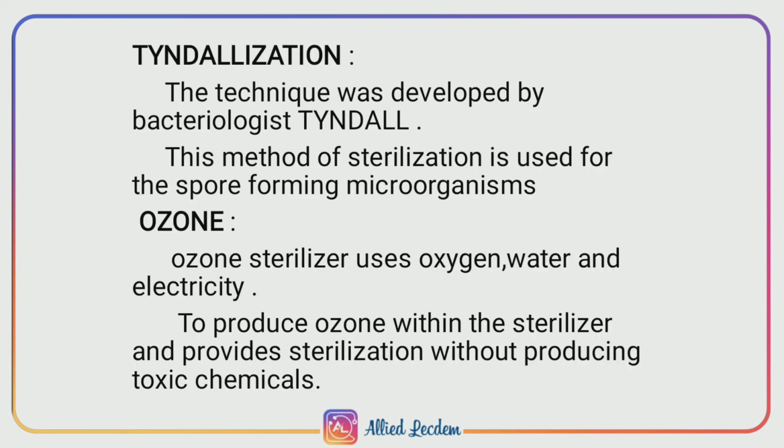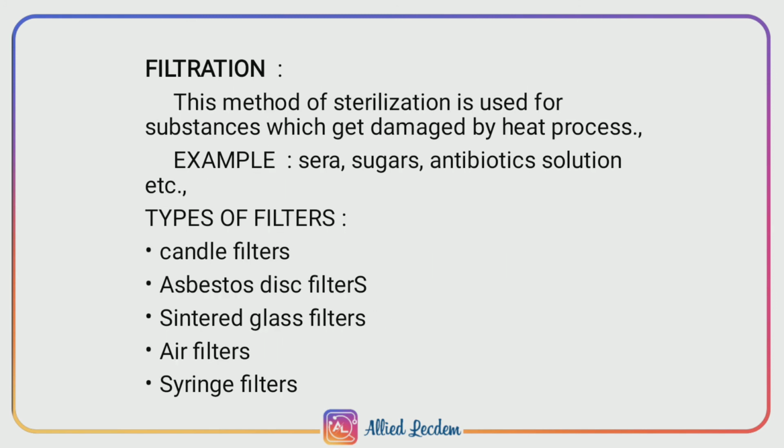Tyndallization. This technique was developed by a bacteriologist named Tyndall. This method of sterilization is used for the spore-forming microorganisms. Then ozone. Ozone sterilizer uses oxygen, water, and electricity to produce ozone within the sterilizer and provides sterilization without producing toxic chemicals.